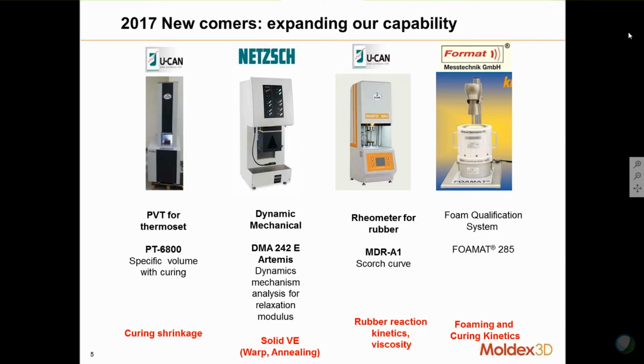So if you are from a polymer background, then you will know something about these instruments. It will tell you everything about its mechanical properties. That's what we call solid viscoelasticity. And it will help you to do the warpage predictions and also annealing predictions.